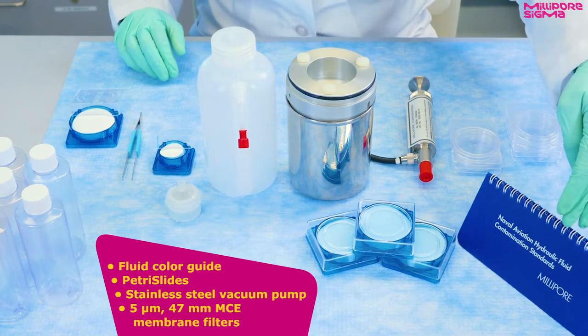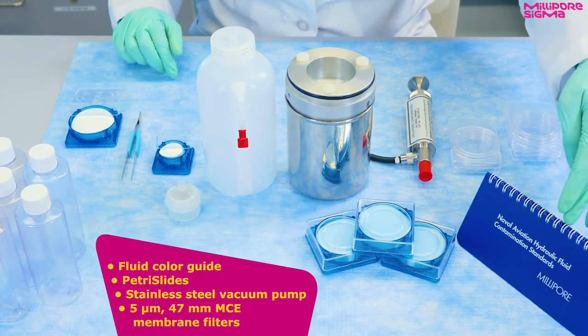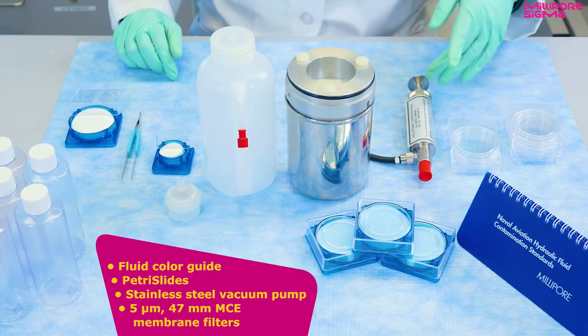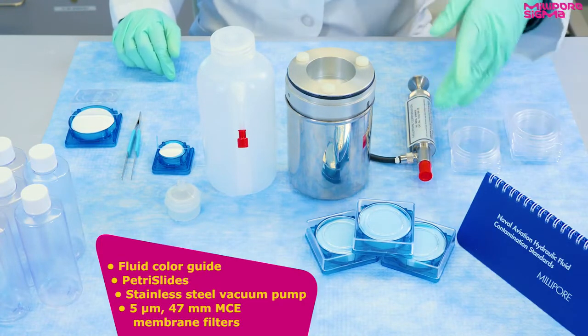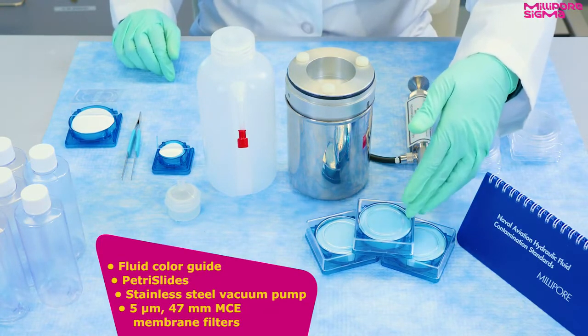The kit includes the following: a fluid color guide for methods requiring colorimetric analysis, Petri slides, a stainless steel hand vacuum pump, 5 micron 47 millimeter MCE membrane filters.